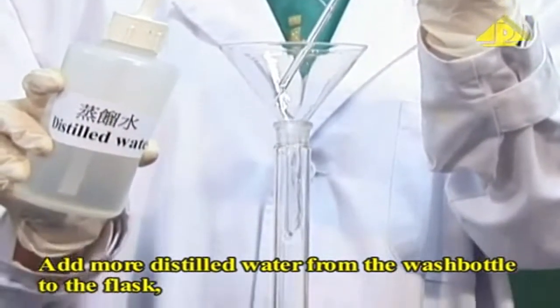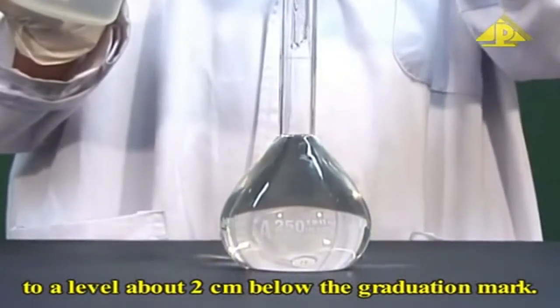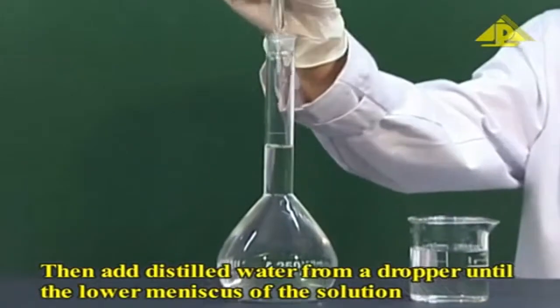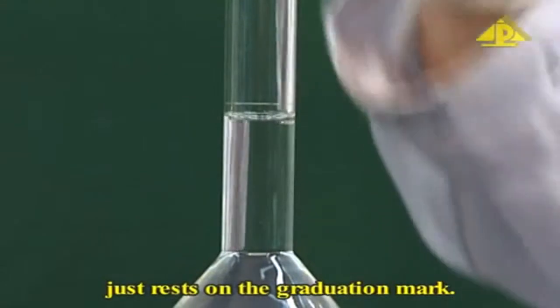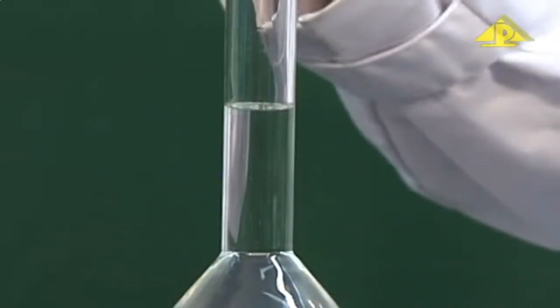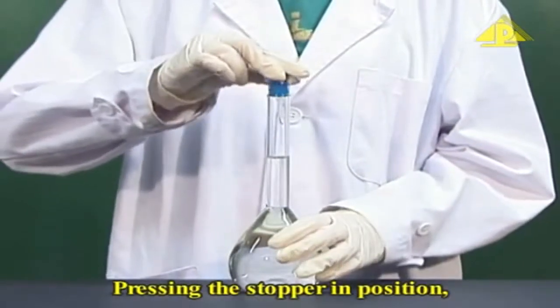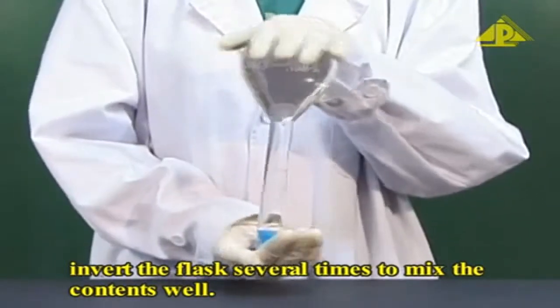Add more distilled water from the wash bottle to the flask to a level about 2 centimeters below the graduation mark. Then add distilled water from a dropper until the lower meniscus of the solution just rests on the graduation mark. Put the stopper in the flask. Pressing the stopper in position, invert the flask several times to mix the contents well.